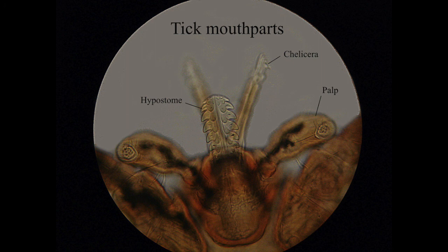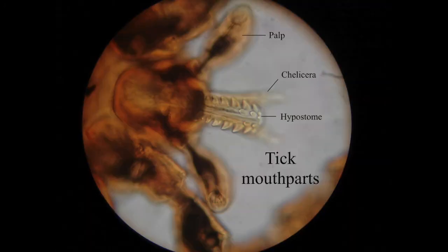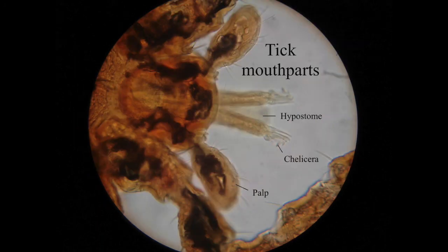This is a close-up of some tick mouth parts. You can see the hypostome in the middle and you can see that it's barbed, so it would be quite hard to take out of your skin. What makes it even harder is the chelicerae — there are two chelicerae forming a V-shape. It pierces you and then they open out into that V-shape with little barbs on the ends, making it even harder to remove. Here are a couple more images — this one focuses mainly on the hypostome, and this one focuses more on the chelicerae.